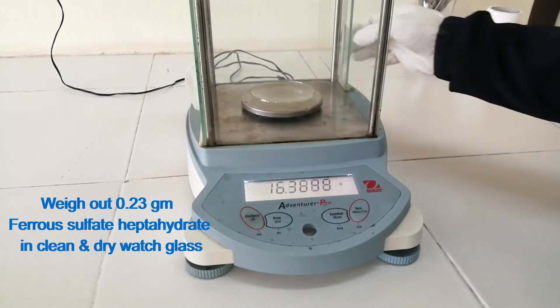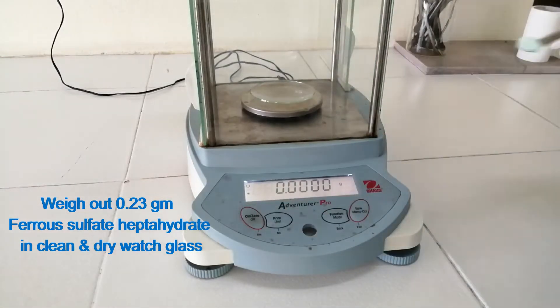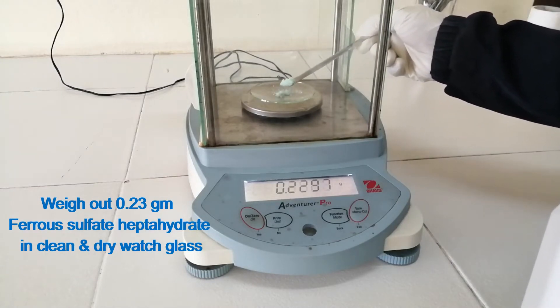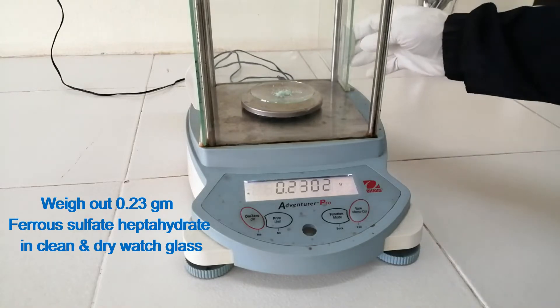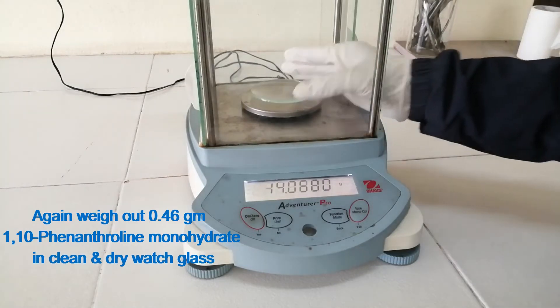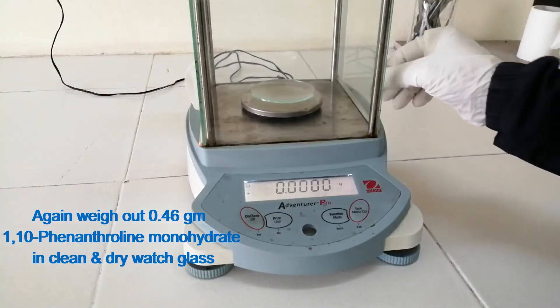Weigh out 0.23 g ferrous sulfate heptahydrate in a clean and dry watch glass. Again, weigh out 0.46 g 1,10-phenanthroline monohydrate in a clean and dry watch glass.